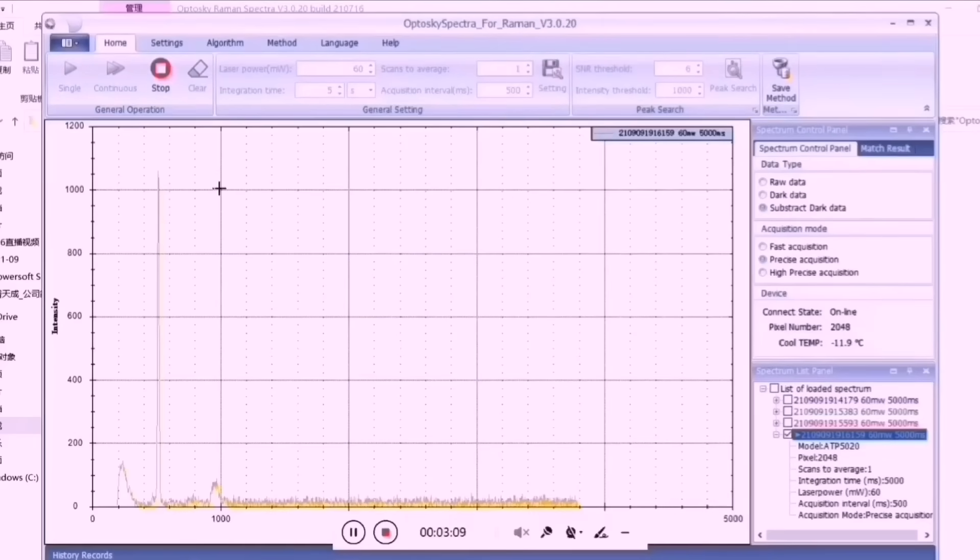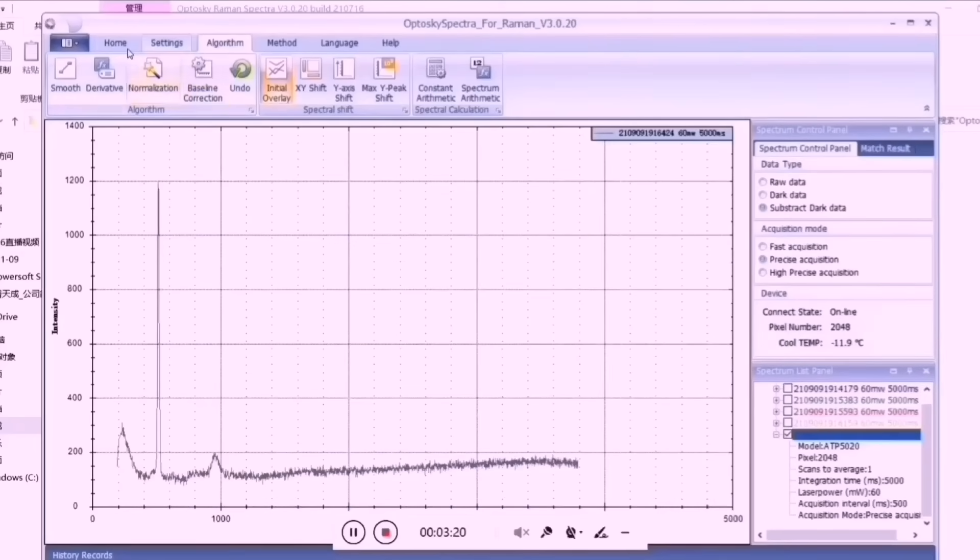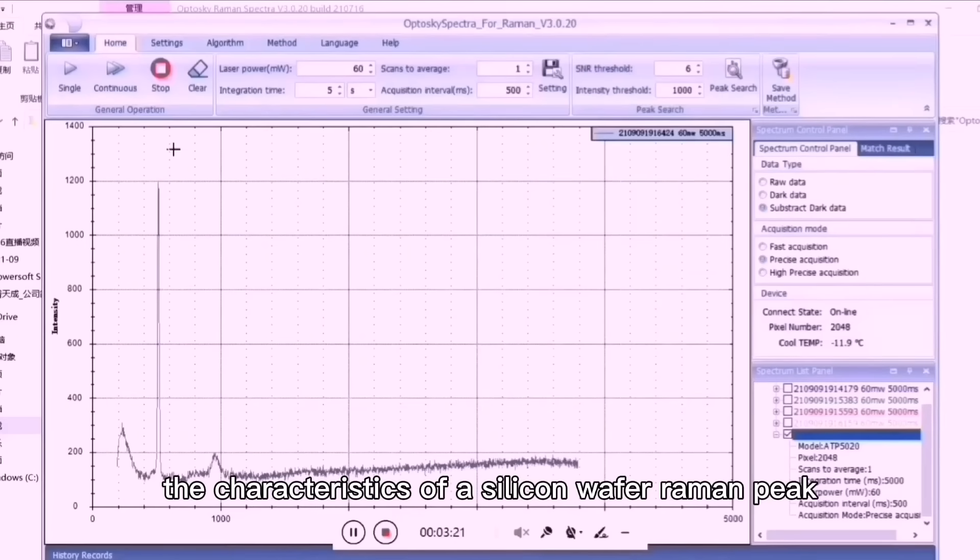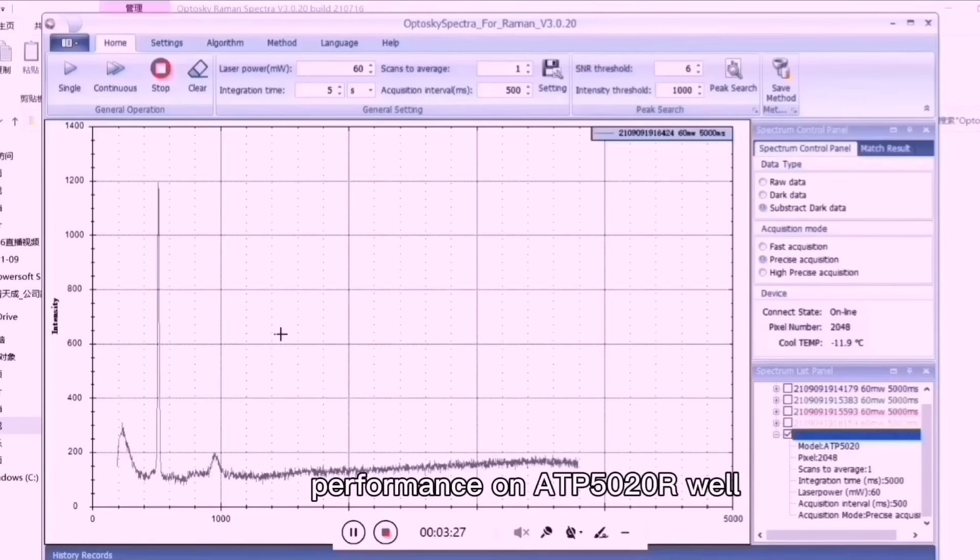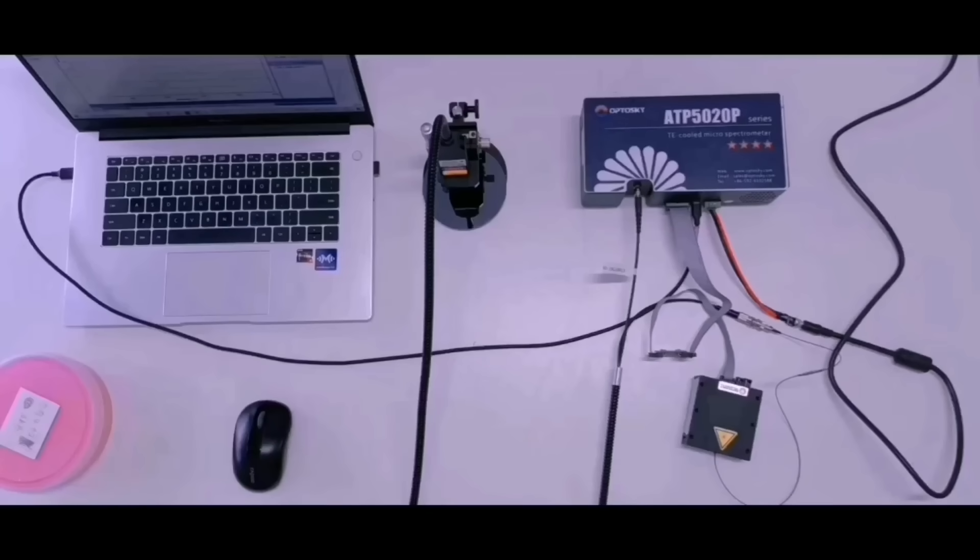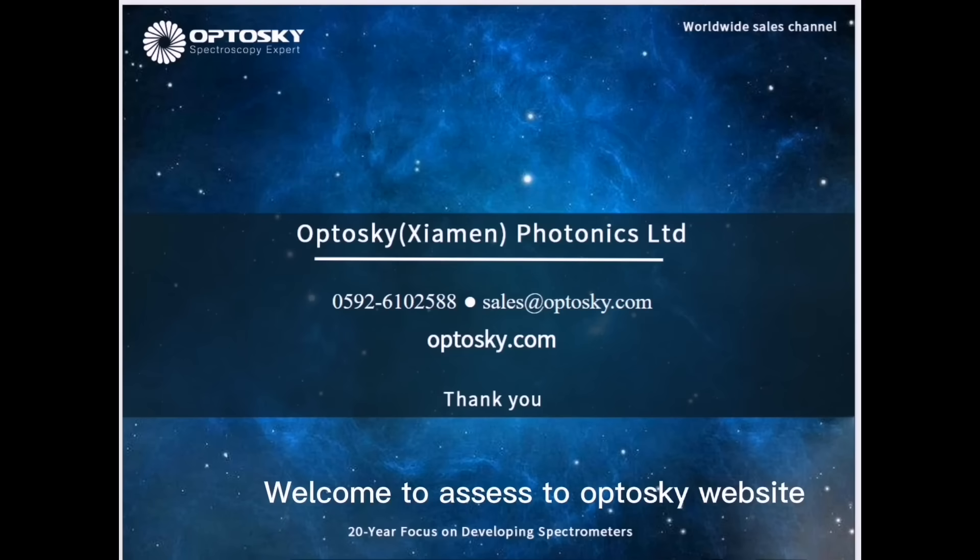The characteristics of silicon wafers Raman peak are displayed, demonstrating the ATP5020R performance. For more information, visit www.optosky.com.